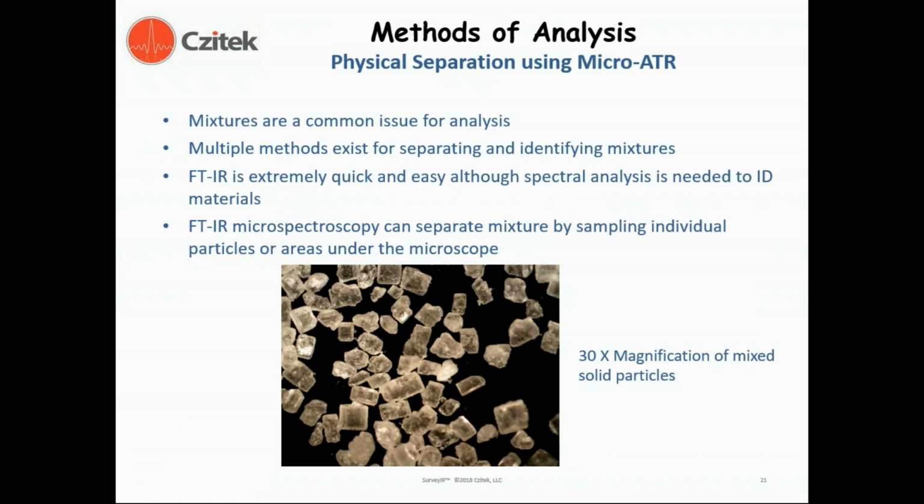Mixtures can be a common issue in microspectroscopy samples, and multiple methods exist for separating and analyzing these different mixture components.